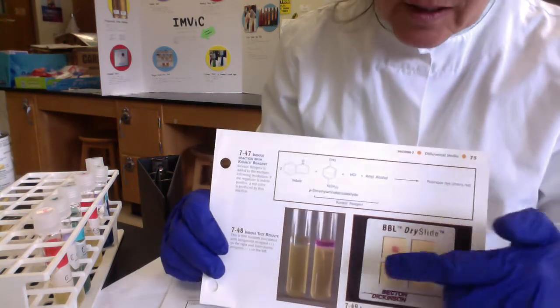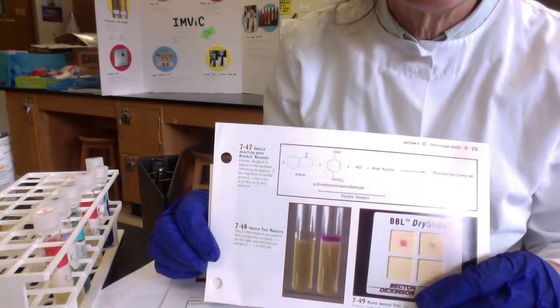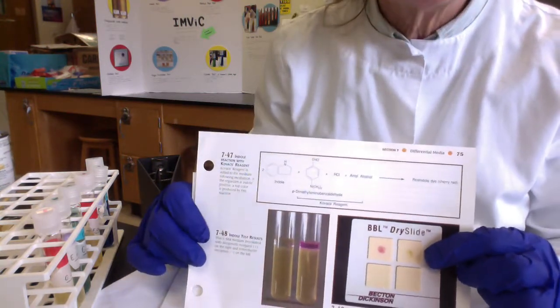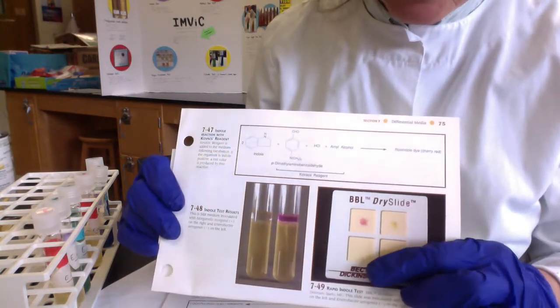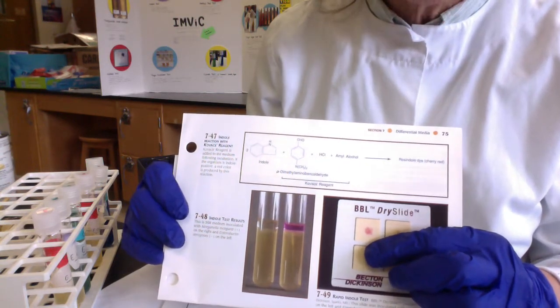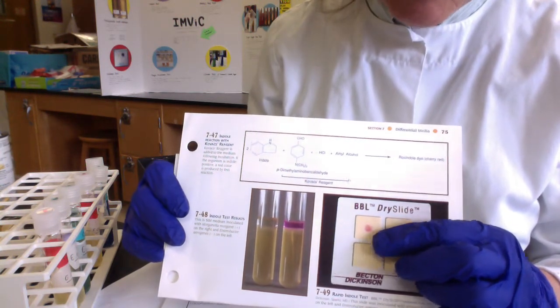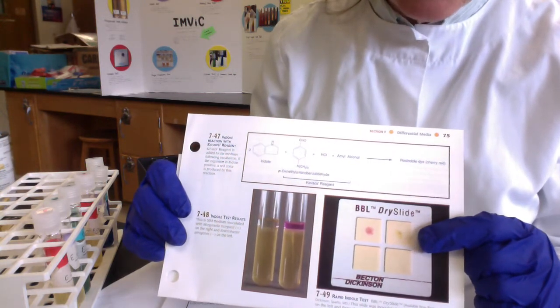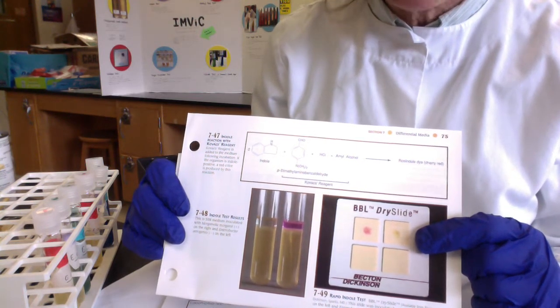And in the old days, we had to use these liquid media, but now, you might recall in the first video on chapter 17, we have these cool little dry slides, over here, that have all the reagents to detect indol. And what we did is we harvested cells from our plate and then smeared them onto the surface of the dry slide. And if the reagents turn pink, that tells us that indol is present, and that tells us our microbe makes tryptophanase. If we smear our cells onto the indol slide and it doesn't turn pink, that's a negative indol test. No indol was made, and it tells you your microbe doesn't make tryptophanase.